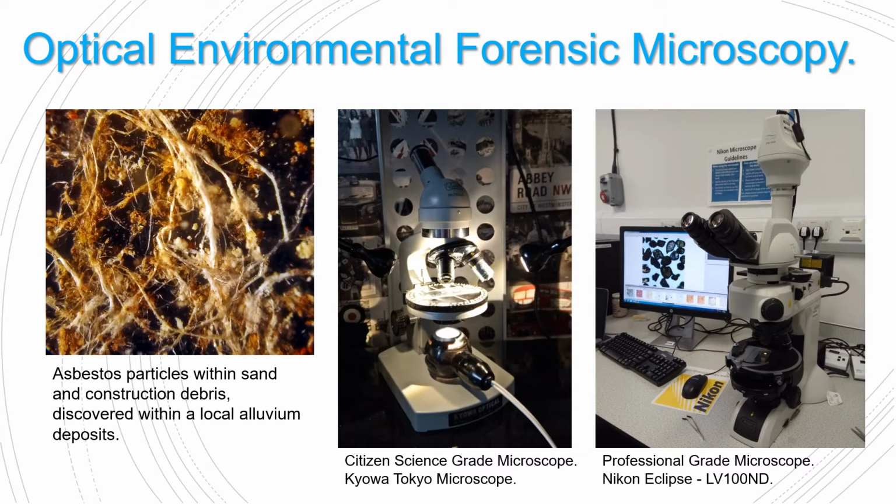What makes this analysis really quite appealing, as it's quite unlike all of the sophisticated methods like SEM or Raman microscopy, is it's a very low cost of analysis. So most of my work used a professional grade microscope, the Nikon Eclipse, but actually very similar findings you could get with sort of citizen science grade microscopes.